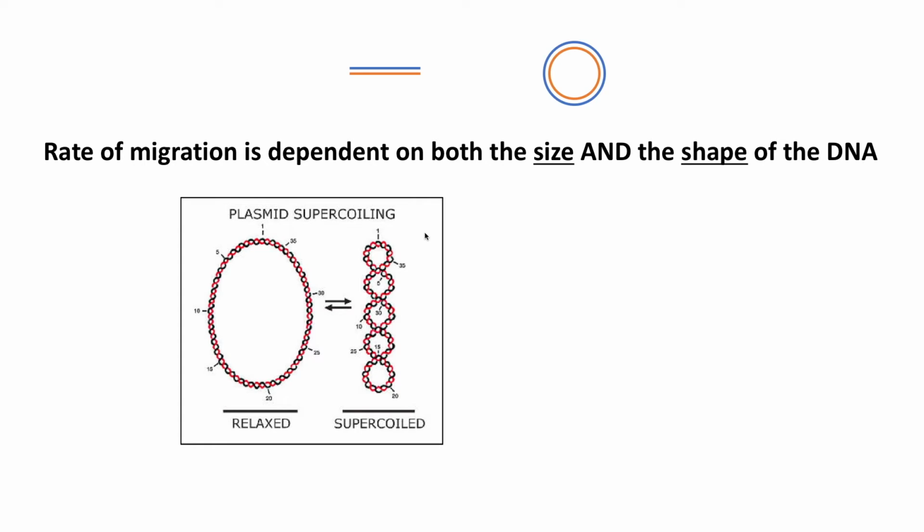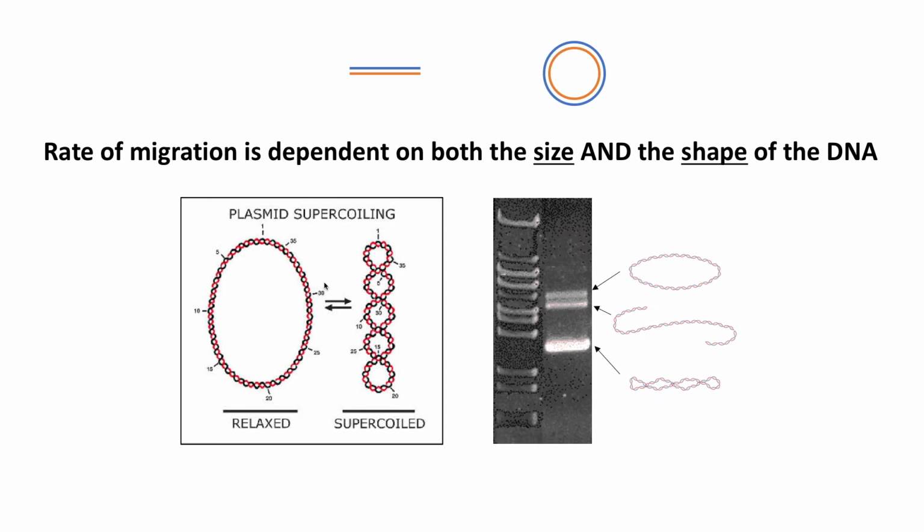Plasmid DNA also can be a relaxed circle. This happens when one strand of DNA breaks, which is also referred to as being nicked. The nicked DNA can then relax from the supercoiled state into circular DNA. If the DNA has a break in both strands, it becomes a linear DNA molecule. Importantly, even though our plasmid is the same size, it will migrate very differently depending on what shape it has. Since supercoiled DNA is compact, it's going to migrate the fastest through the gel. The other two forms of DNA will run similarly, with the relaxed circular form running more slowly than the linear form.